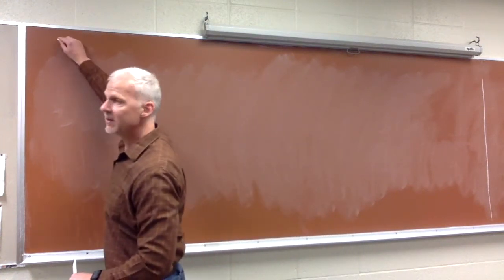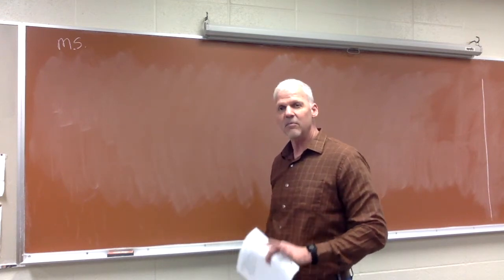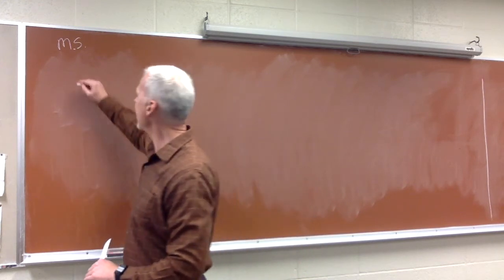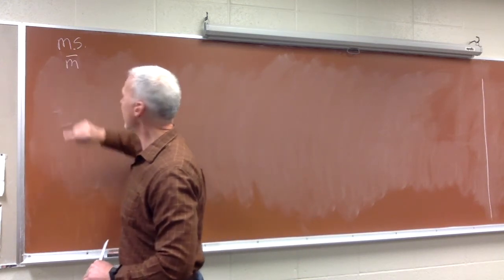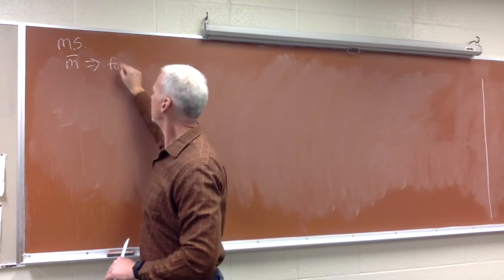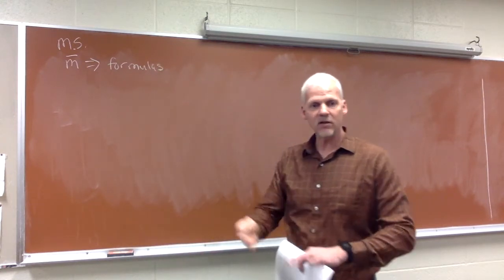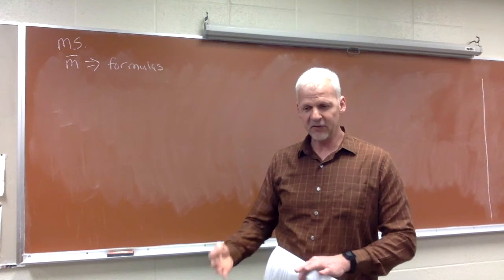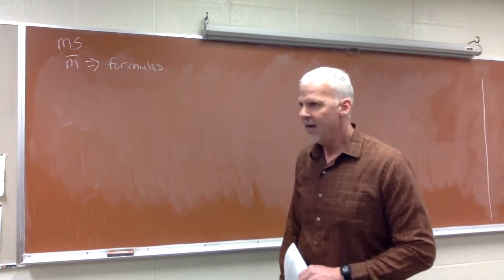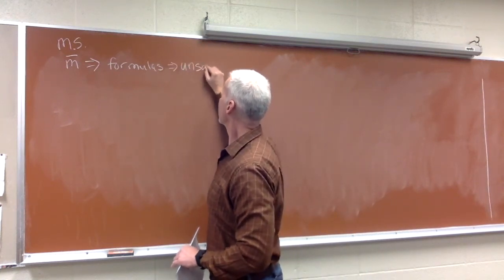So it started off with mass spectrometry, otherwise known as MS. And from the mass spectrometry, the big information that we got from it was the molecular weight, which we got through the molecular ion. And so we have the molar mass of the compound. If you recall from that, we could generate formulas where we'd look at how many carbons would go into the molecular weight and then fill the rest of the weight with hydrogens. We could look at oxygen as a possibility, nitrogen as a possibility. And then once we had some possible formulas, we could further calculate unsaturations.